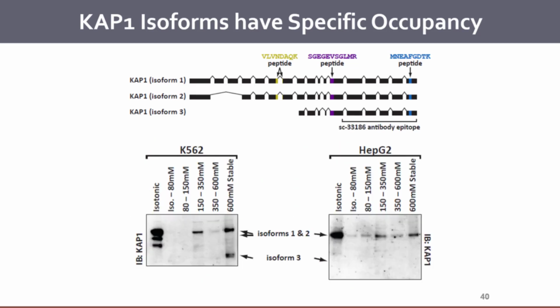So which value would you give it? It's hard, right? These are not straightforward to give. We know that protein exists as different proteoforms. We just don't know what those proteoforms are. So I'm not saying that we don't want to come up with one.